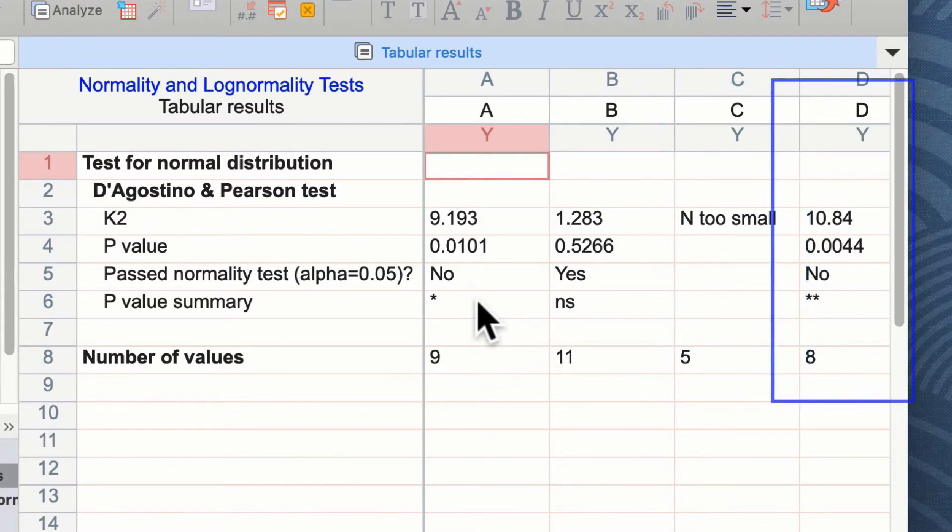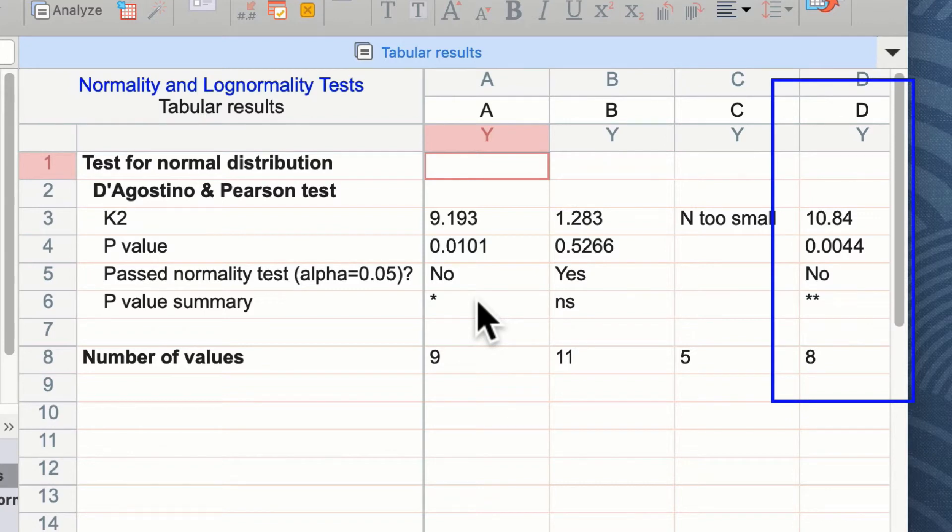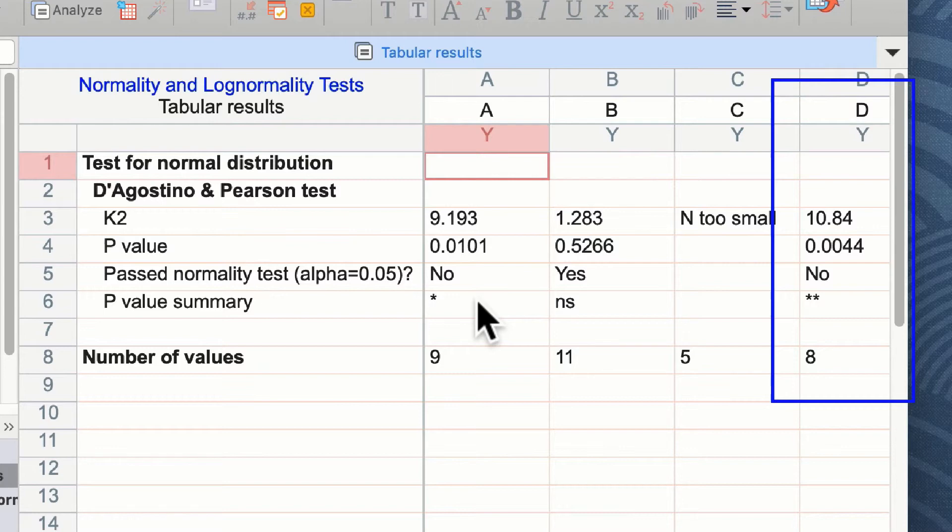If you remember from the graph, I questioned the distribution of group D, thinking that they were a little bit too tightly bunched to be normally distributed, and you can see here it failed the normality test with a p-value of two stars. This really shows that these data are not normally distributed and would be unwise to carry out a parametric test on these data.